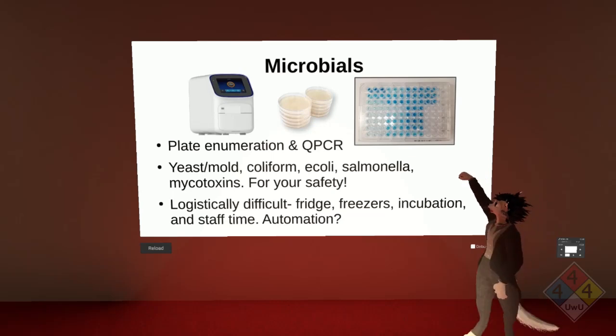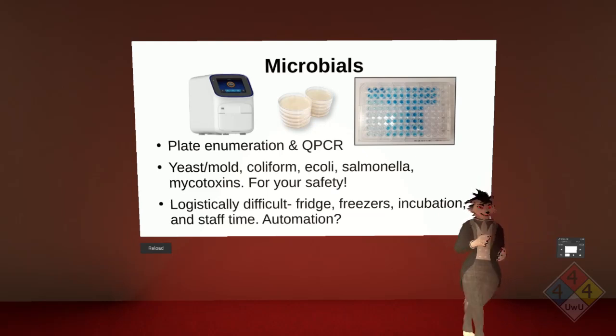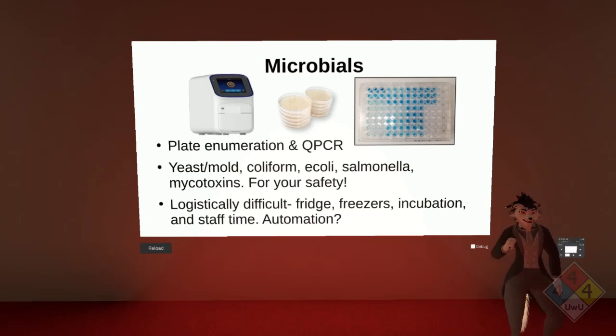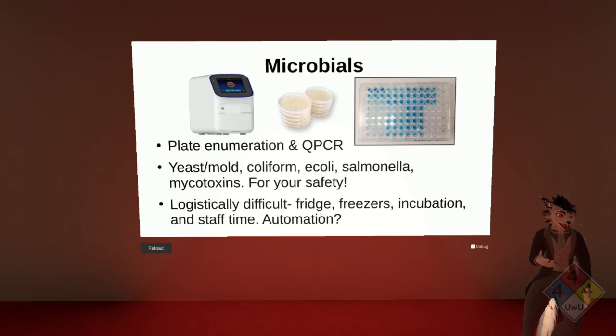But there's a lot of pipetting in microbials. The reason it's not necessarily the most glamorous is because these are live cultures. You have to keep them alive. You have to incubate, you have to fridge, you have to freeze them appropriately, or you're going to ruin your work. It's a lot of precise pipetting that's very easily contaminated because you're a human being and a walking source of contamination. So it's not the easiest work. It's very repetitive, and it's very easy to screw up, and some of these things are actually dangerous.